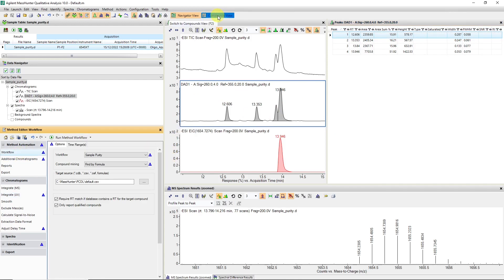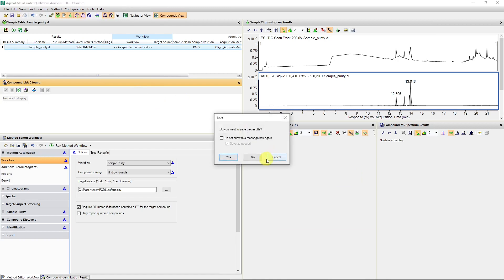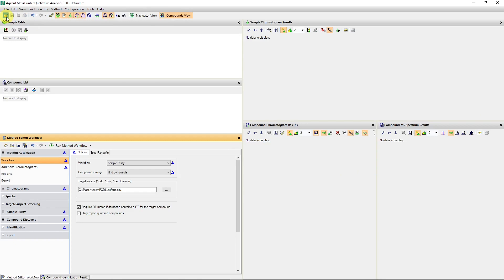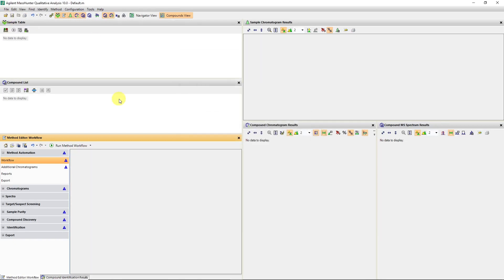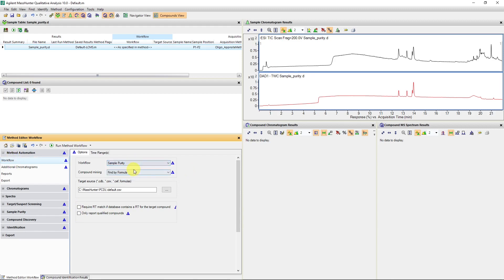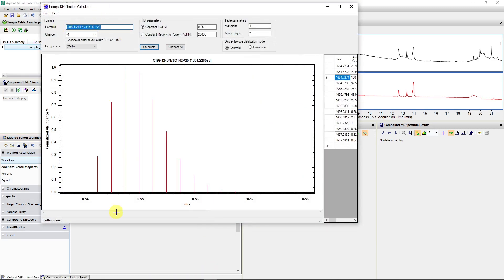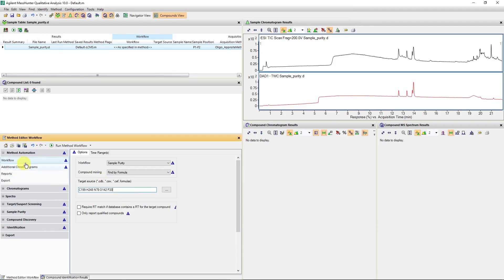To manage this more easily, I'm going to go to Compounds view and close the data file to start with a clean slate, then open the file again without loading any results. We can now see a total wavelength chromatogram as well as a total ion chromatogram and total wavelength chromatogram from the UV being extracted. I'm in my workflow editor and I want to run a sample purity using a formula — I'm going to put my formula in for the RNA oligonucleotide.